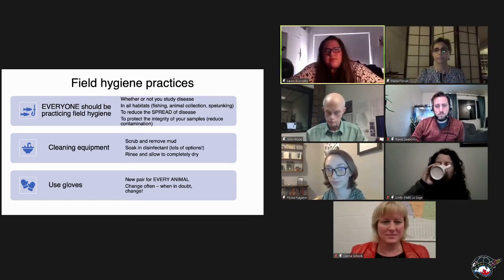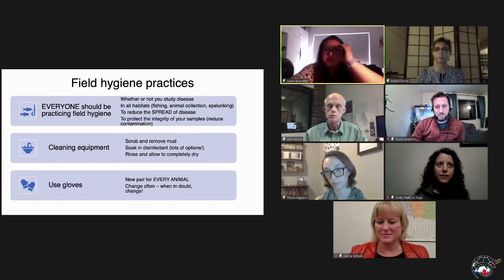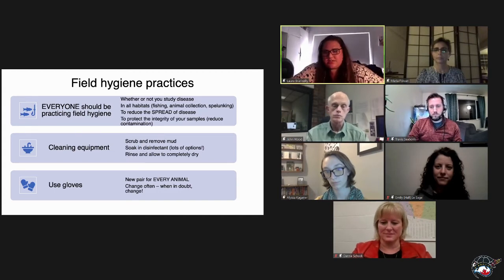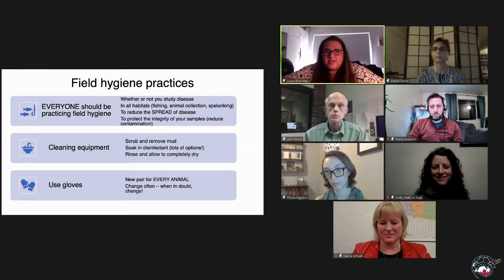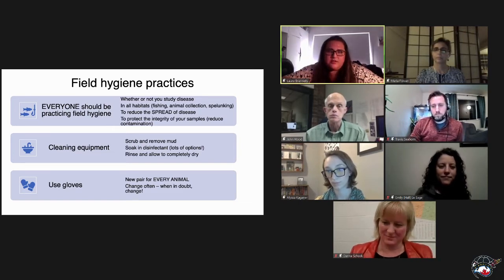For spiking your water samples to figure out your detection limit, I know we were talking about winter samples. That's actually what I used, February samples in these ponds. This might also address Chris's question about whether winter sampling might be a good time to test for pathogen eDNA, because those frogs are hibernating in the water. At my sites, pathogen load on the animals was really low in the winter. The animals tend to come into spring with really low loads, and then it pops up during the spring. So it was a pretty safe bet for me to say that those samples had no Bd DNA.